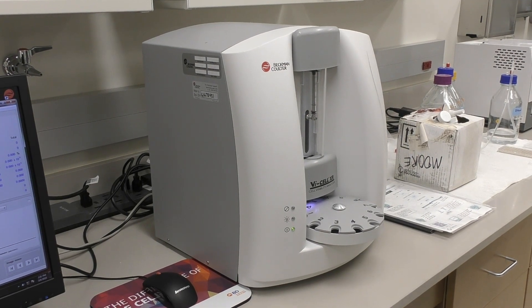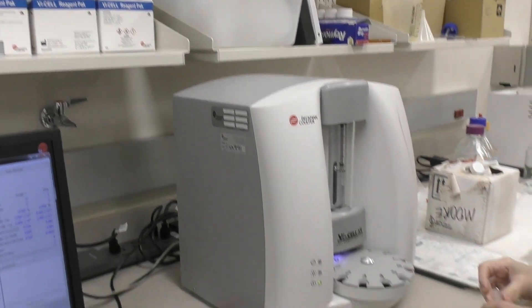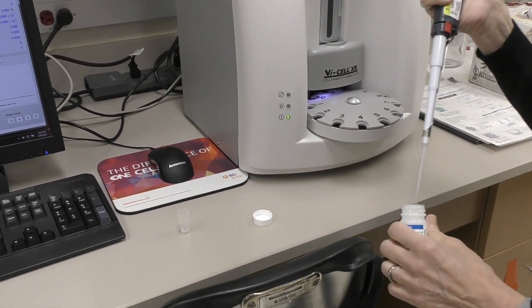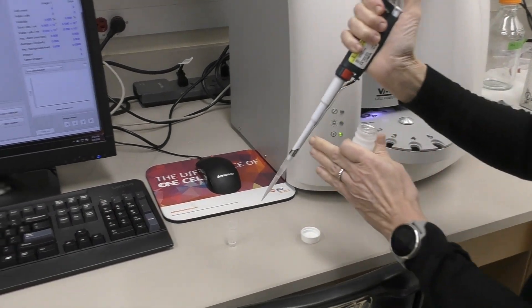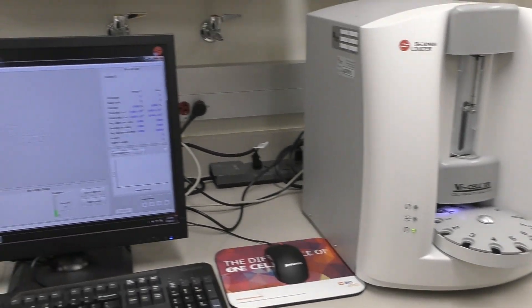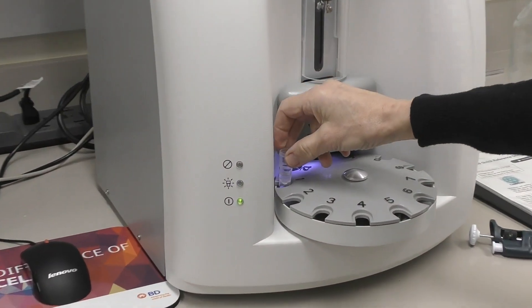It's very simple to use. You just get a sample cup from the bin up here. You want to use at least 500 microliters of sample — that's how much the instrument will draw up. You will place the sample cup in the carousel.